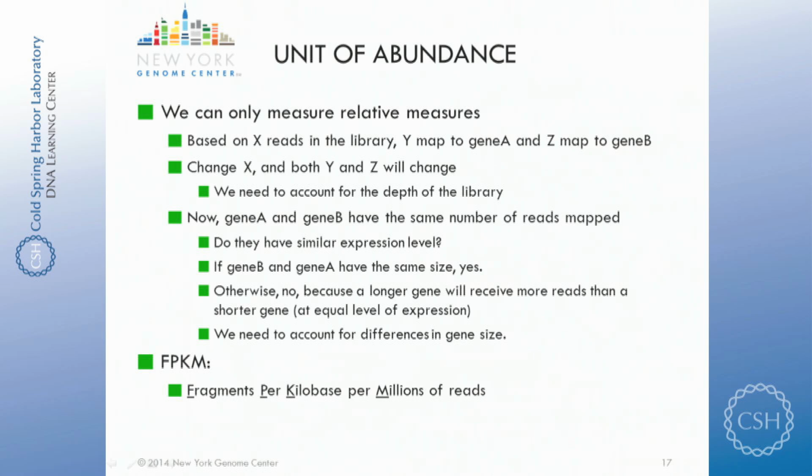You should say gene here, you should say transcript. Yeah. Because a gene could be the same size, but have very different transcript size. And since this is RNA-Seq. Sure, sure. Yep, good point. Yeah, exactly, and Cufflinks really works at the transcript level.